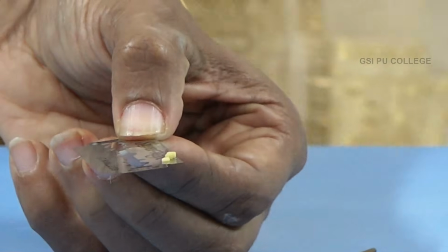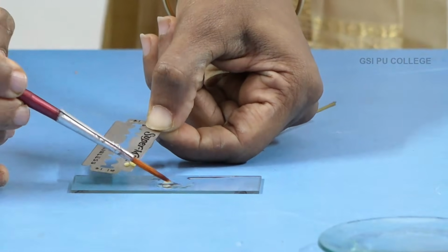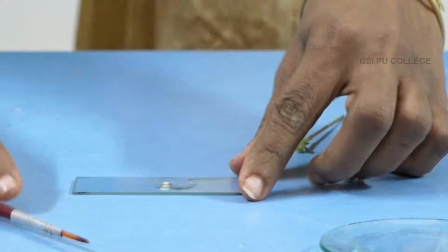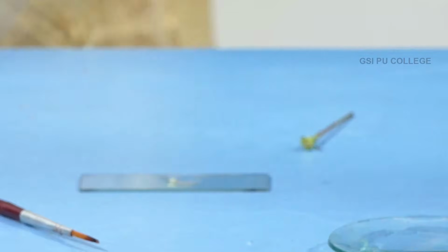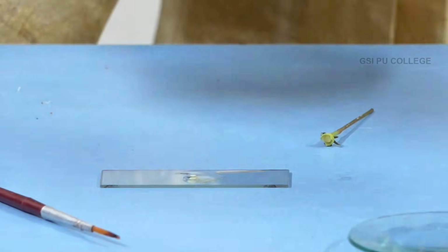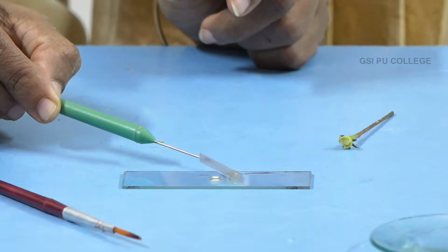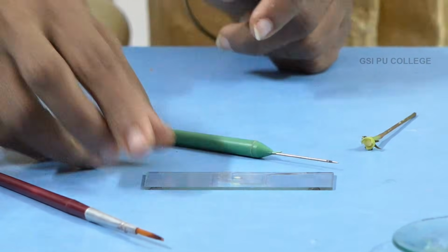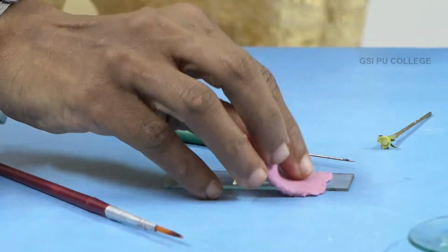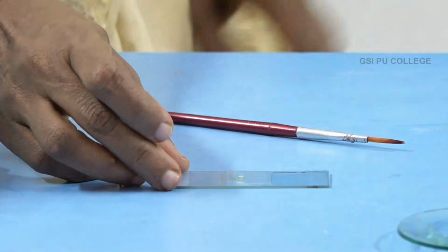And then with the help of a brush, you have to transfer this section onto the slide. Then cover this with the cover glass, like this. If extra water is there, wipe it with blotting paper, and this is ready for observation.